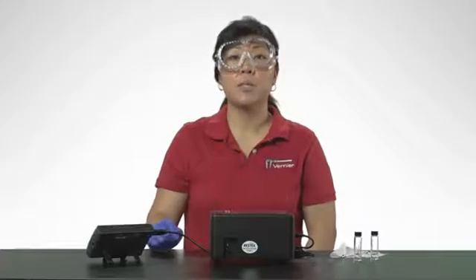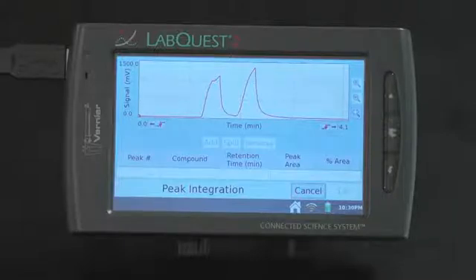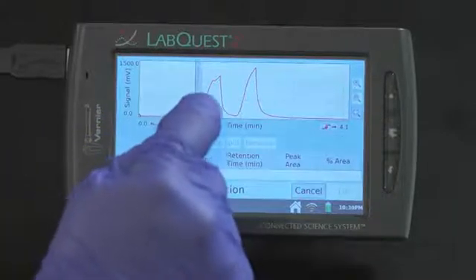To select and integrate the peak, drag across the graph from a little before the peak to a point far enough to the right so that the entire peak is selected. Choose Add.